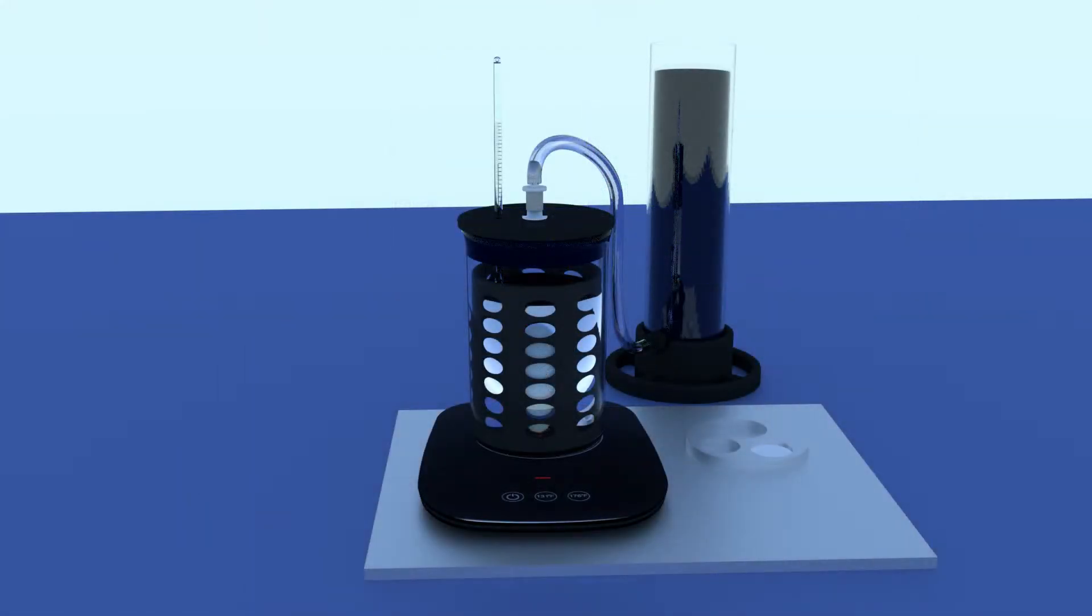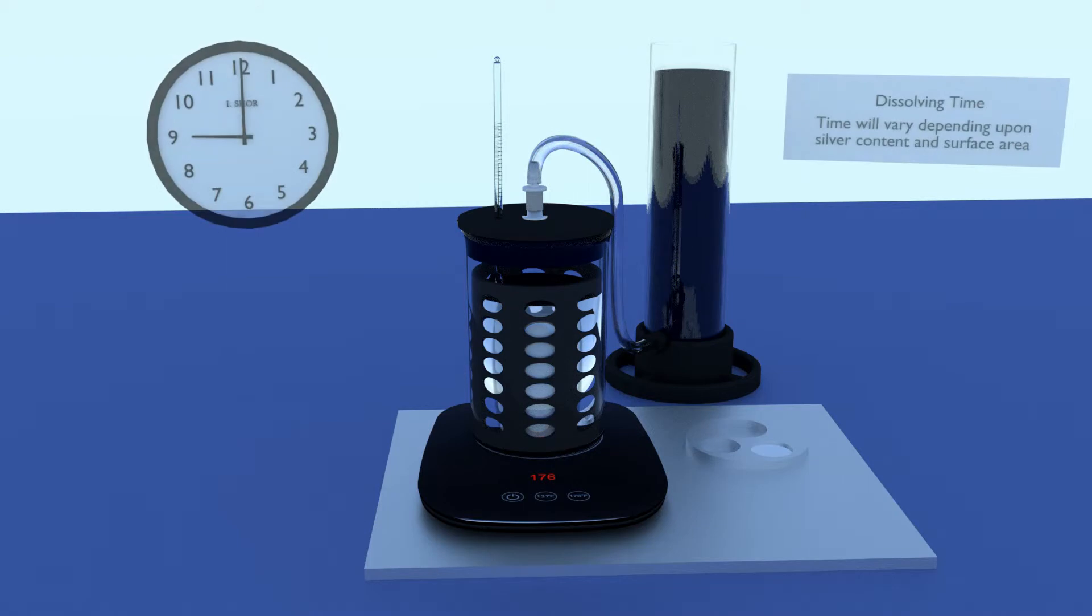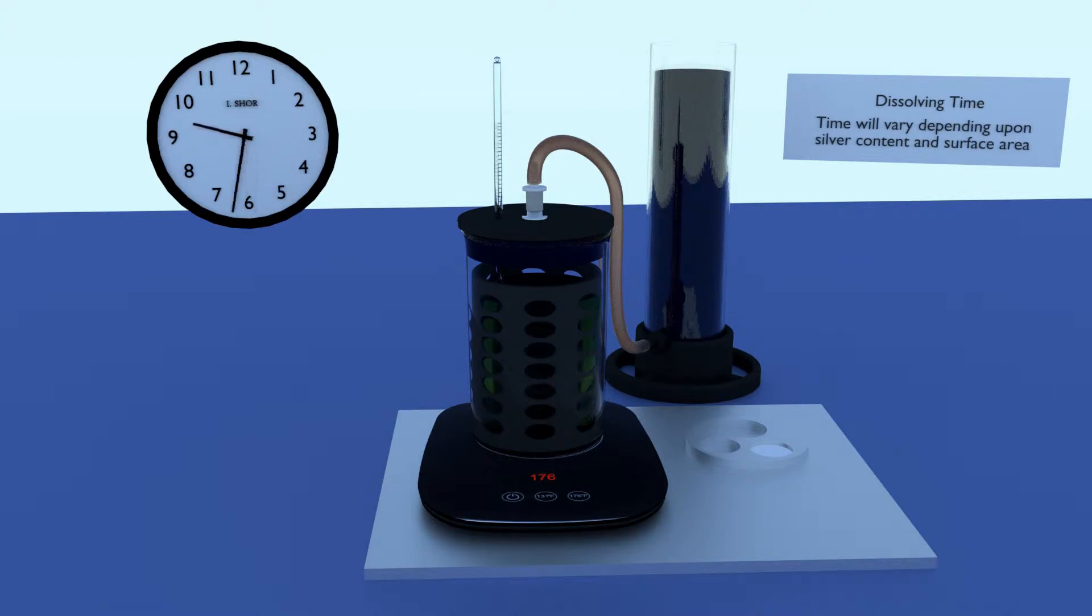Plug the hot plate into a convenient outlet. Press the on button to turn the unit on, then press the 176 button to set the temperature. The time required to dissolve your metal will vary depending largely upon the surface area of your metal and the silver content. Typical dissolving time is around one half hour to one hour. However, the time can increase significantly when refining items that are thick and have a high silver content.